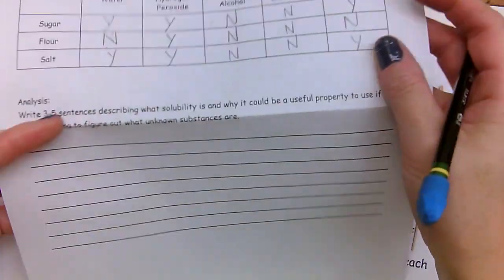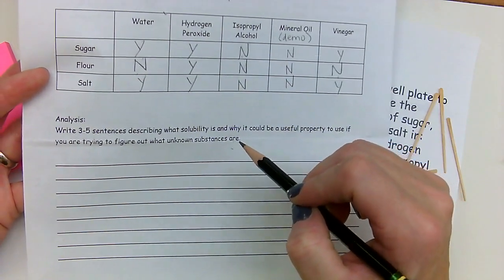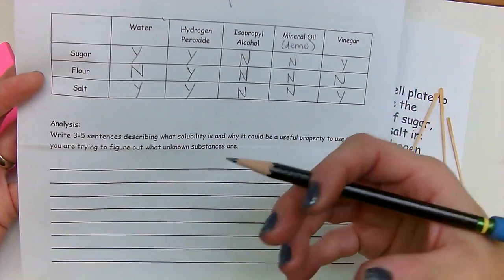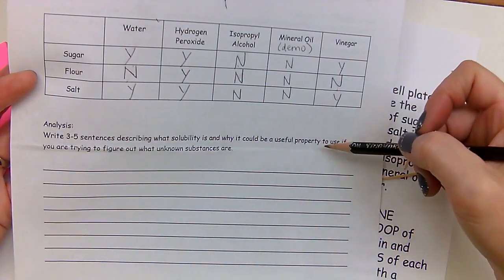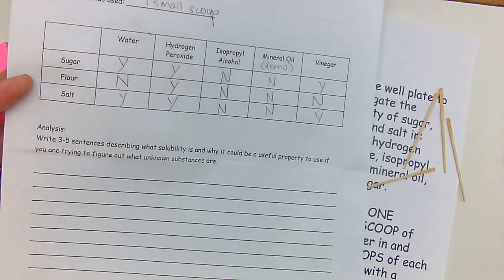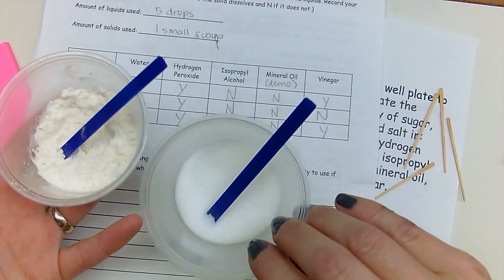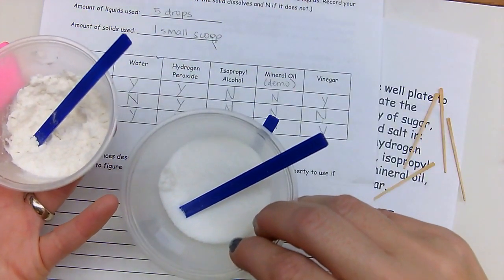The last part of the lab, you guys are going to write 3 to 5 sentences describing what solubility is. Like, what does it mean when something is soluble, either a liquid being soluble in a liquid or a solid being soluble in a liquid. What does that mean? And why is this a useful property to use if you're trying to figure out what an unknown substance is? So if you saw this powder and you didn't know it was flour, how would you know it's flour? If you saw this substance and you didn't know it was salt, how would you know it was salt? And if you saw this substance, how would you know it was sugar?